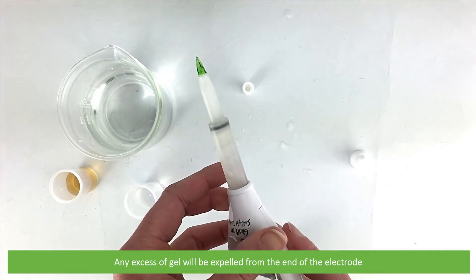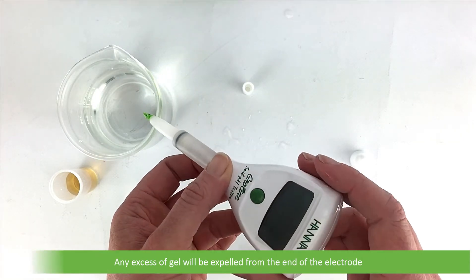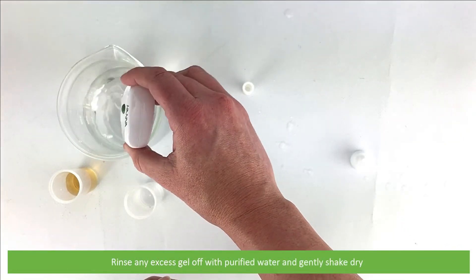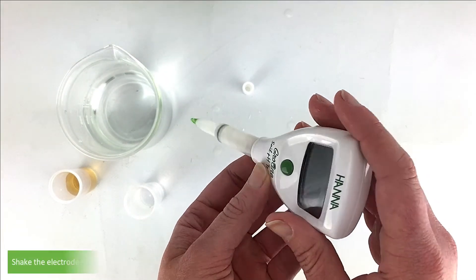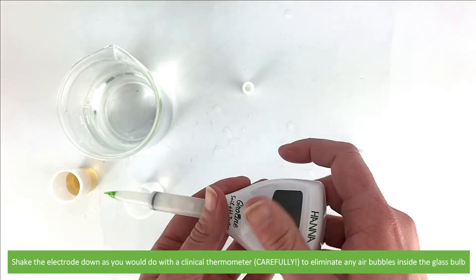Any excess gel will be expelled through the end of the electrode. Rinse off any excess gel with purified water, then gently shake dry. Shake the electrode down as you would with a clinical thermometer to eliminate any air bubbles inside the glass bulb.